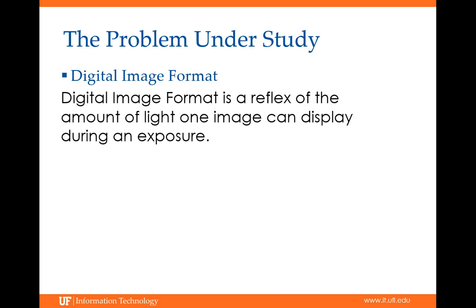Digital image format. Digital image format is a reflection of the amount of light one image can display during an exposure. In an image, the intensity information is stored in different lengths of storage space varying with the camera quality. Usually, we capture a 16-bit image.